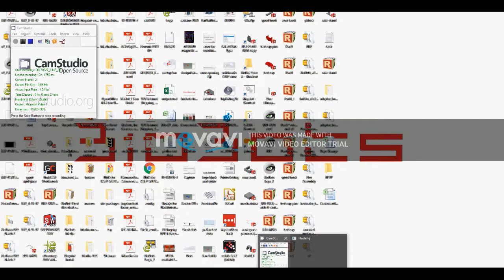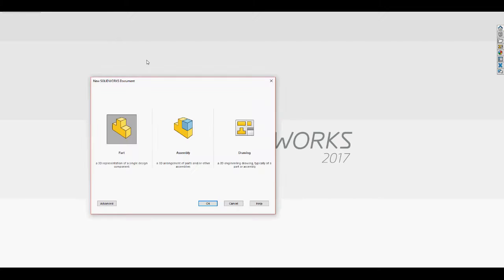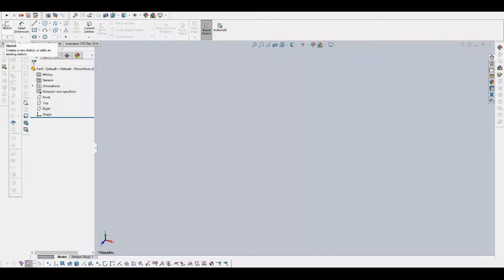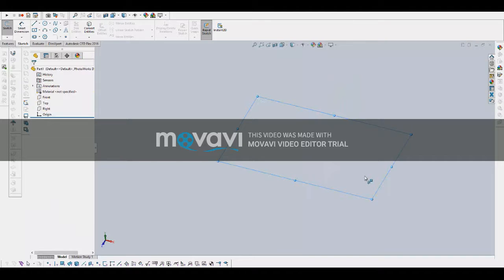Okay, so today we are going to review how to design a basic lattice for bioprinting on your BioBot using the software SolidWorks. This general approach can be used with any CAD software that can export an STL file. First, select to create a new part, then click on Sketch and select your plane.